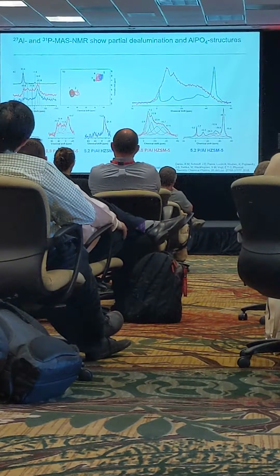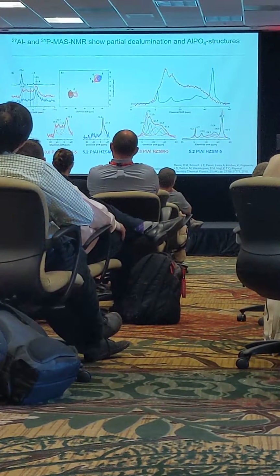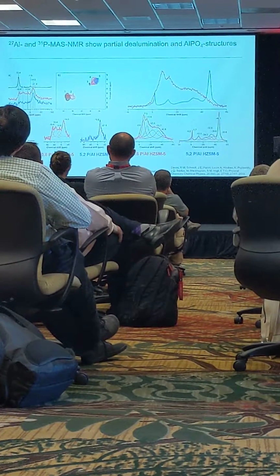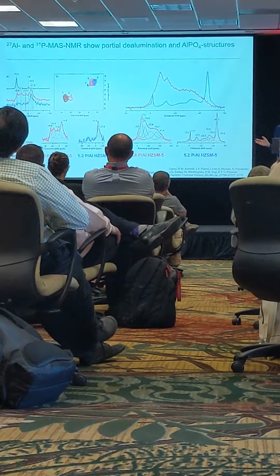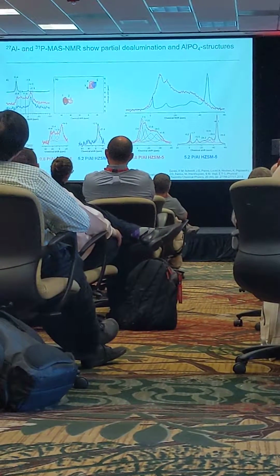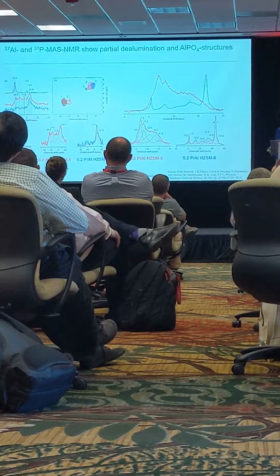Okay, the phosphorus is distributed well, but how is it actually bound to the framework? What is it bonding with? Oxygen atoms? Something else? And the team went and did some NMR work to really look at that. There's quite a bit of information on this slide. I'll try to walk you through it at a high level.